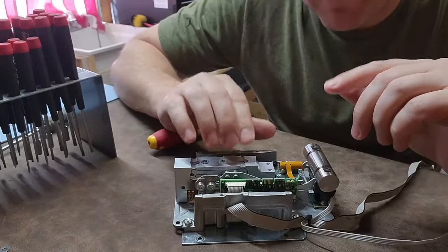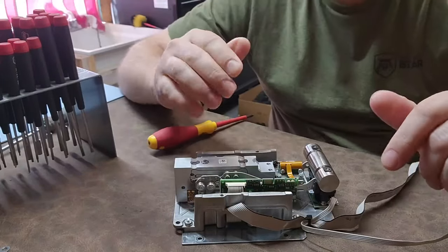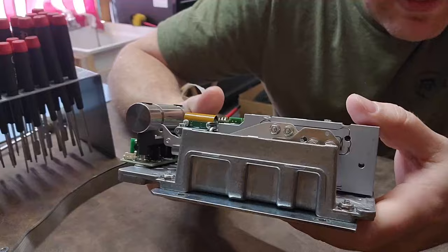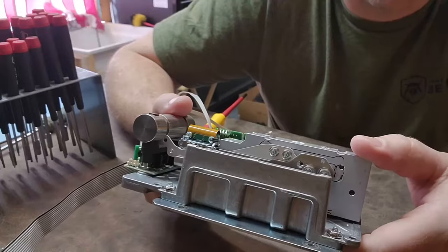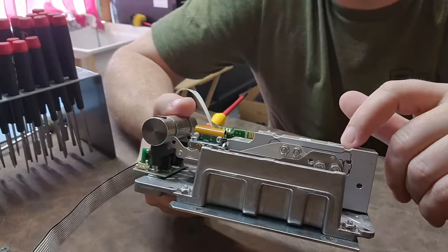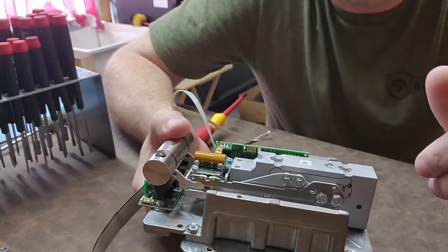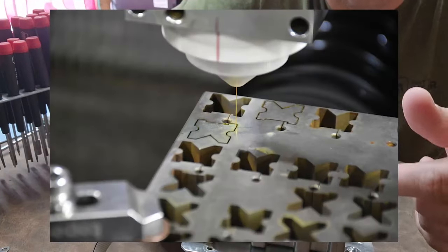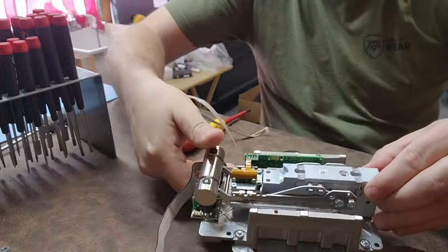The range of movement on this load cell is very, very slight. I barely press down on it, and the reason for that is these wire EDM cuts right here. These wire EDM cuts are so slight. You can see there are relief cuts and wire EDM slots — they take an electromagnetic discharge and remove material in very specific quantities, in paper-thin traces. You can see a little bit of light shining through right there.